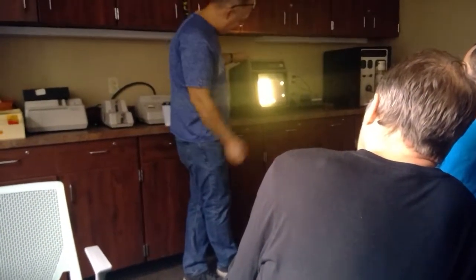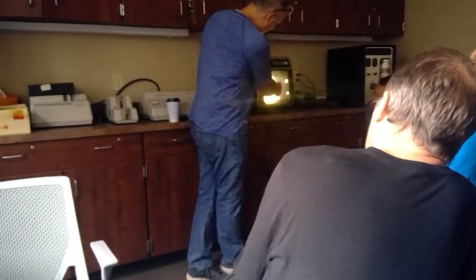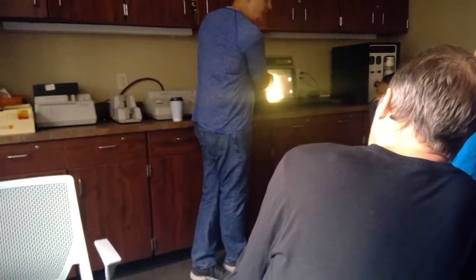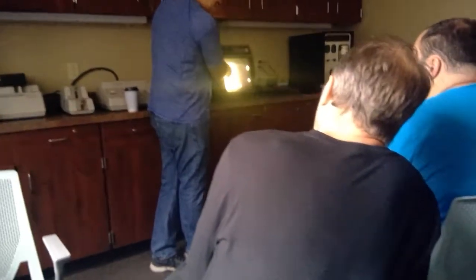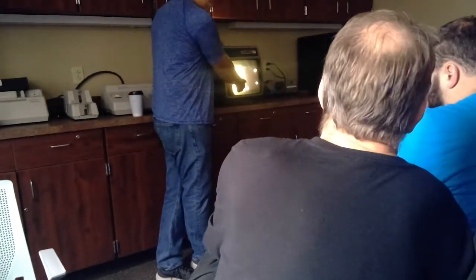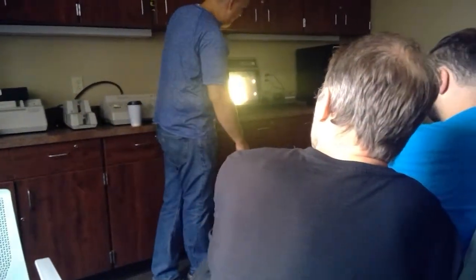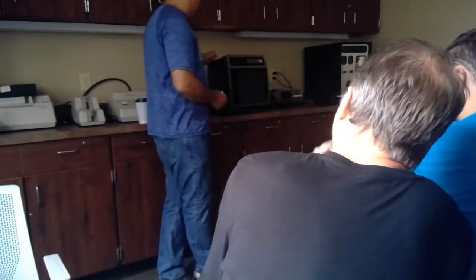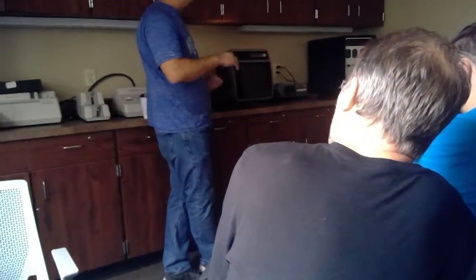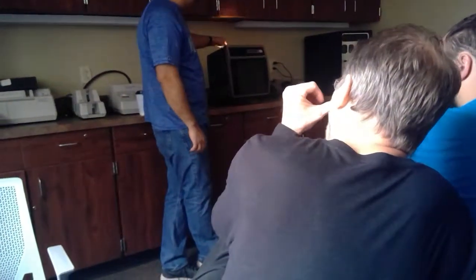No, it's not an oval fat body. Because, and I would tell you guys this, if I presented this, for whatever reason it's off, this is it without polarization, that does not look like a renal tubular epithelial cell. See the little dimple in the middle, I call it? Starch will also polarize light, okay? This is actually a starch grain. That's trash, something kind of insignificant. But a starch granule can appear in polarized light as also having the Maltese cross appearance. But I wouldn't do that to you on the practical. I'll be straightforward. I'll make sure that it's very simplistic.